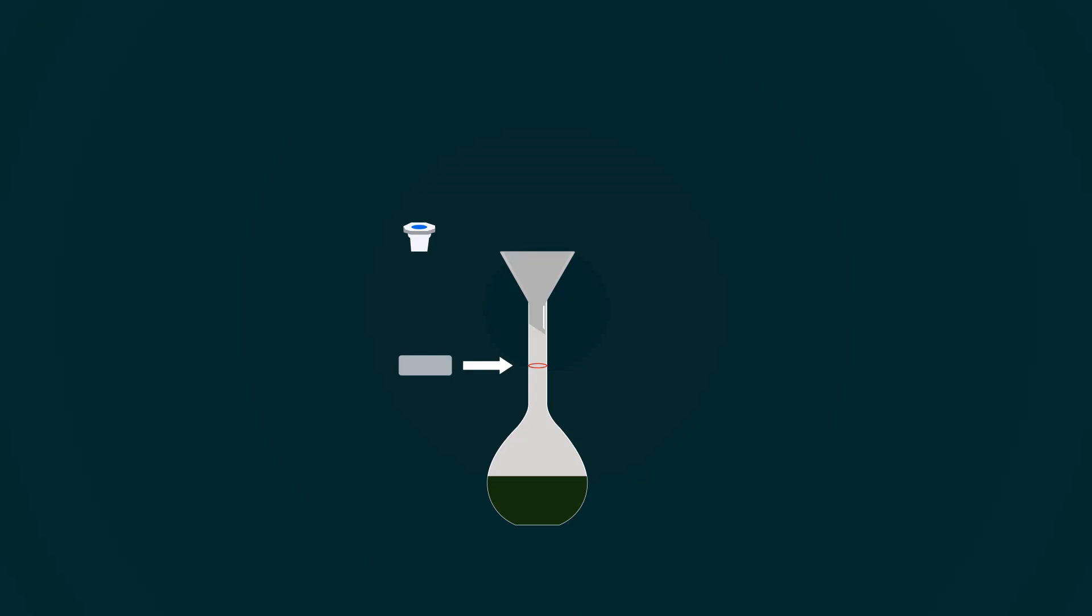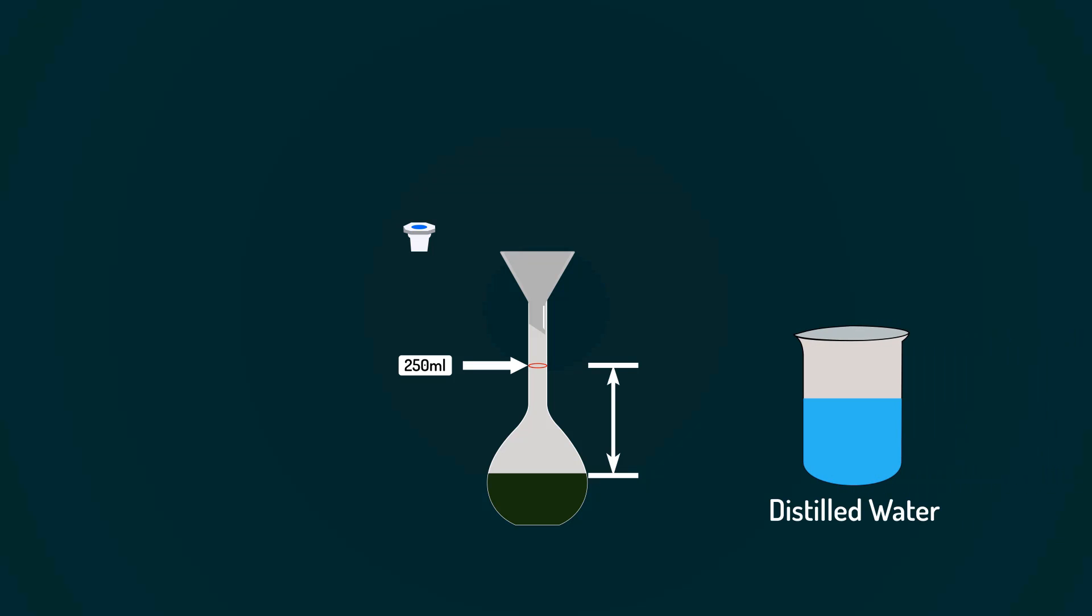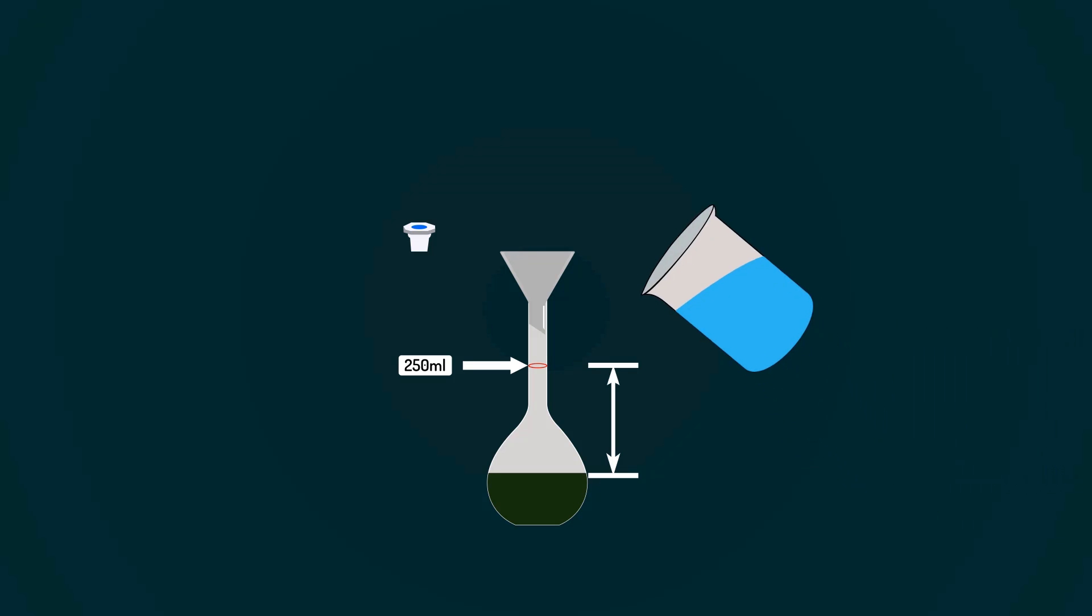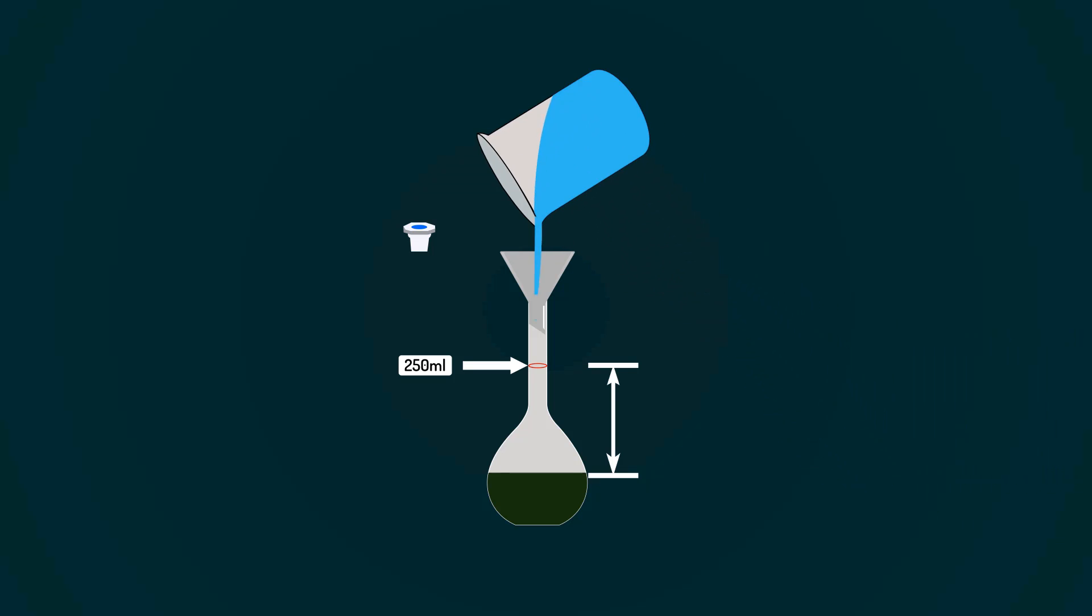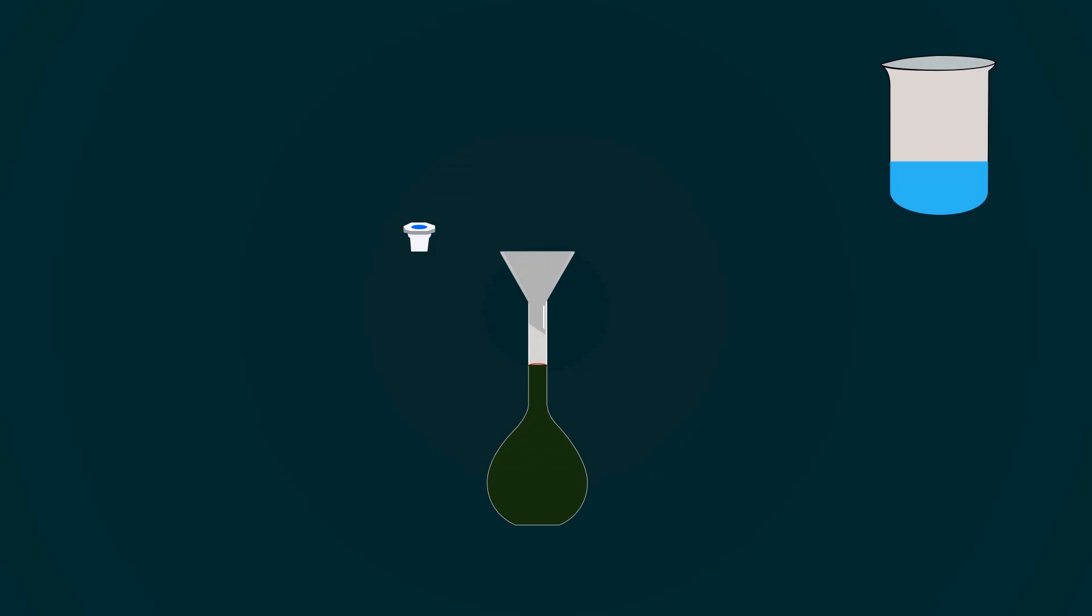We have to fill the volumetric flask with distilled water up to the 250 milliliters mark. So, take distilled water into an empty beaker and add this into the volumetric flask up to 250 milliliters mark.